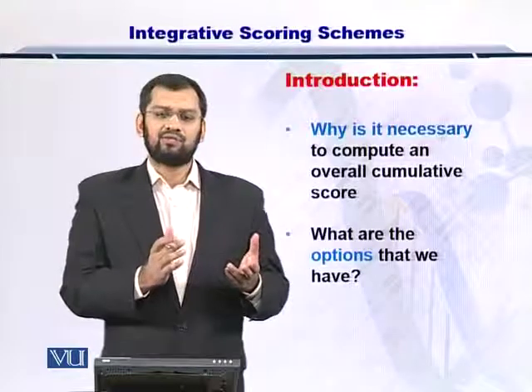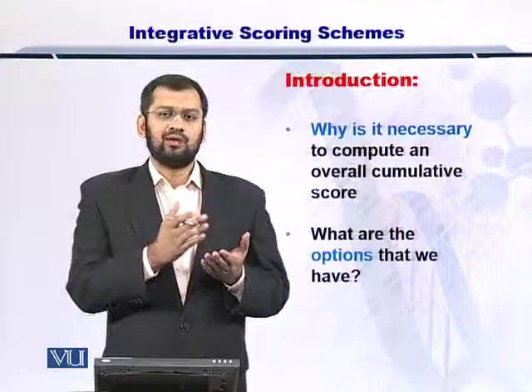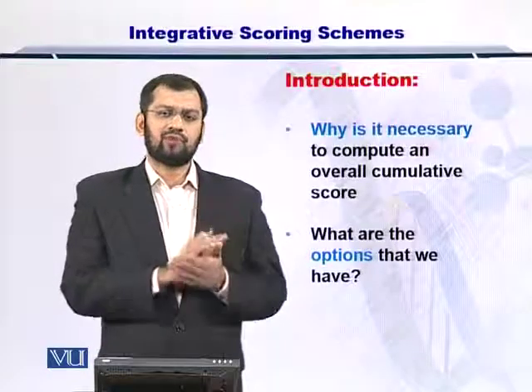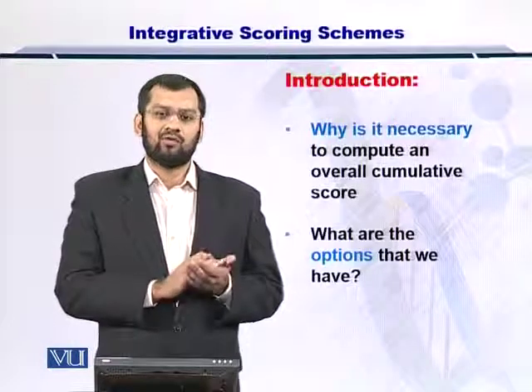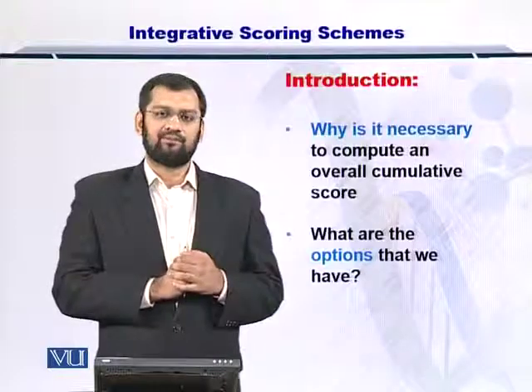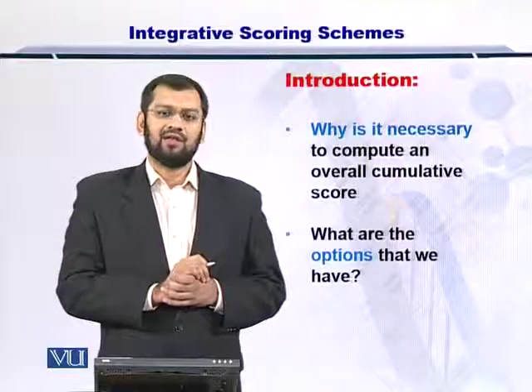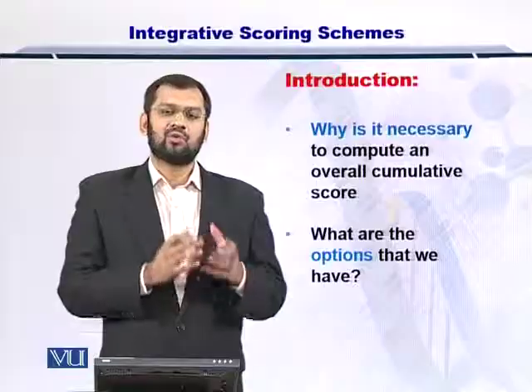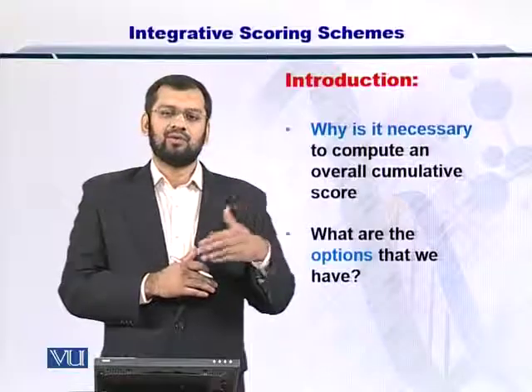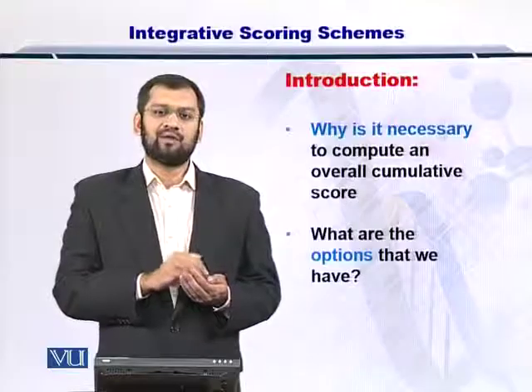For PSTs, we looked at the length of the PSTs and how they compare with the candidate protein. So that can range from, let's say, integer 1, 2, 3, 4, and so on. For the in silico and in vitro spectral comparisons, we simply got the counts: how many peaks matched with the in silico spectra. So this information is quite heterogeneous, and we need to integrate that into a normalized score in order for each of these components to have a meaningful say towards the final score. So this is why this is an extremely important step in the protein search.